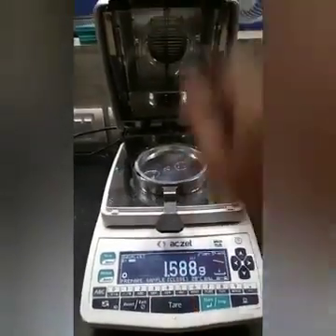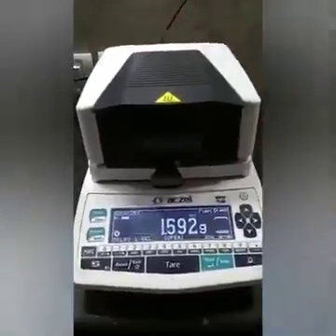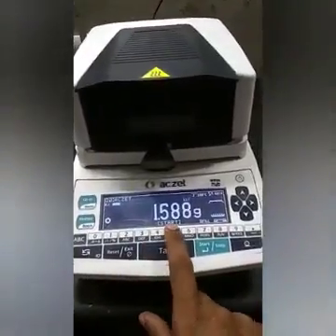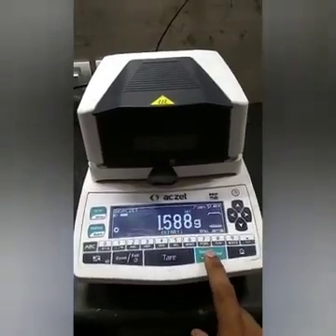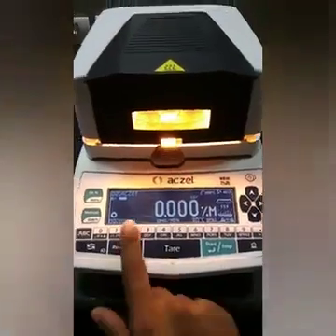Here you can see the 'close' option — close means close the cover. Now it will show a countdown and then tell you to press the start button again. Press start, and the halogen will turn on.